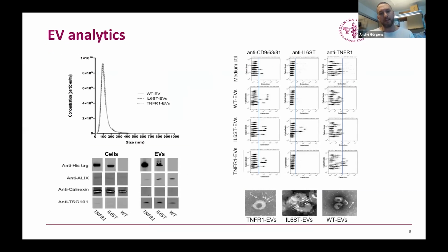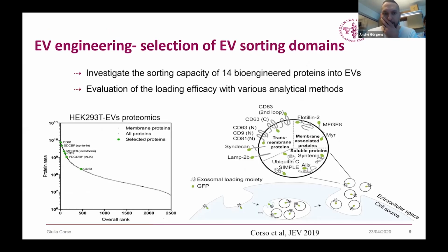And these are some of the EV analytics that we always use for our EVs and engineered EVs. This is a phenotyping of engineered exosomes that I will talk about at the end of my talk, but basically what this includes is nanotracking analysis and Western blot. We do bead-based flow cytometry to look at the vesicles. We run electron microscopy, and André will talk more in detail about the single vesicle flow cytometry by image-based flow cytometry that we do to look at individual vesicles.